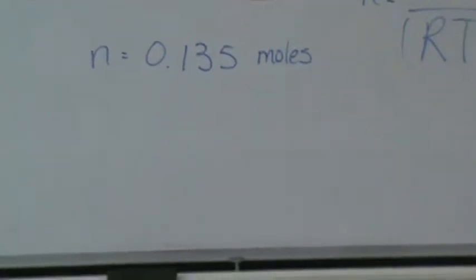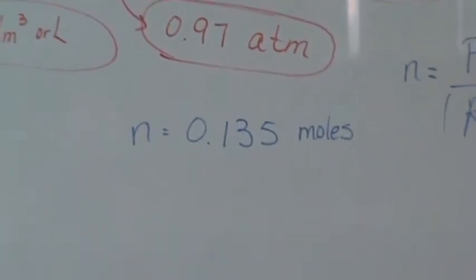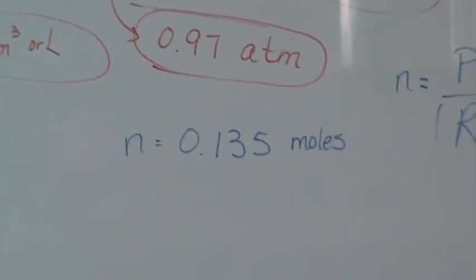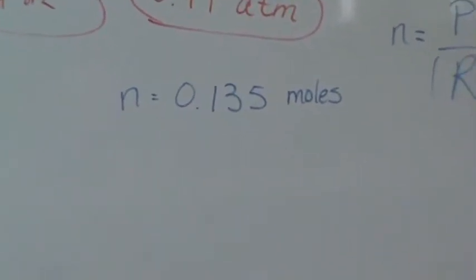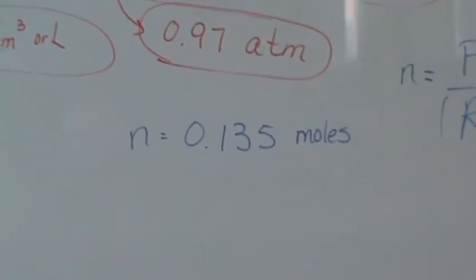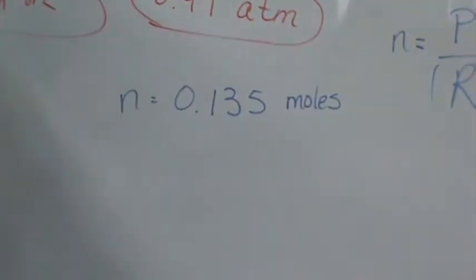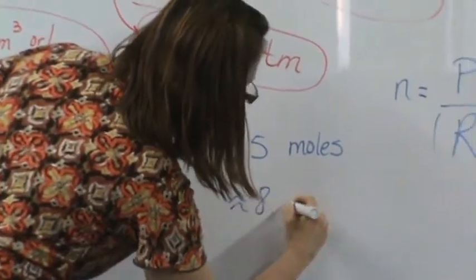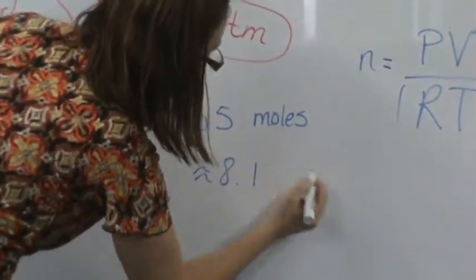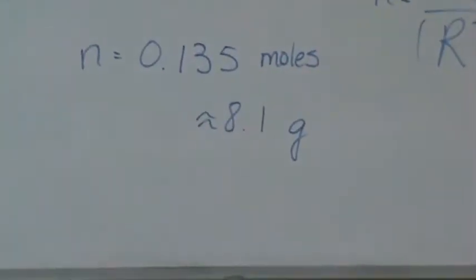It says you should expect 200. It says calculate your percent error from what you expect, 200 grams, according to the reaction, based on 200 grams of vinegar. So how many grams do you end up with? 8.1, 8.13, 8.1, 8.2, somewhere around there, grams, right? Of CO2, okay?